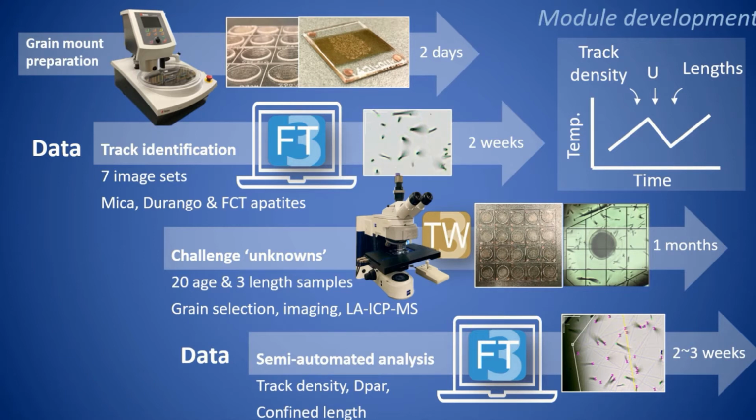It is undeniable that lab-based training experience is irreplaceable, but given the unprecedented 2020 situation, visiting other labs may not be easy due to various restrictions. Our aim is to use the experience learned from the lab routine to develop an image-based approach to deliver a traditionally labor-intensive training to the analyst's computer.